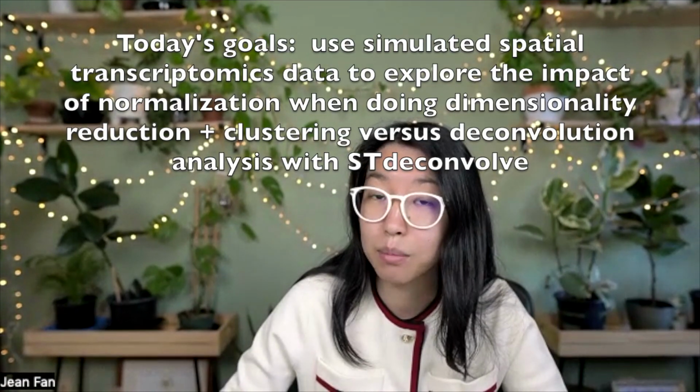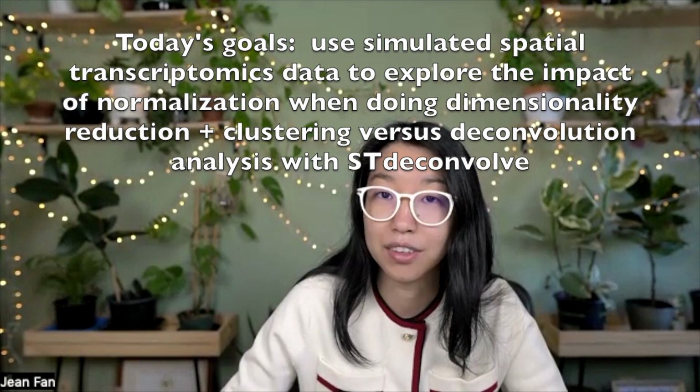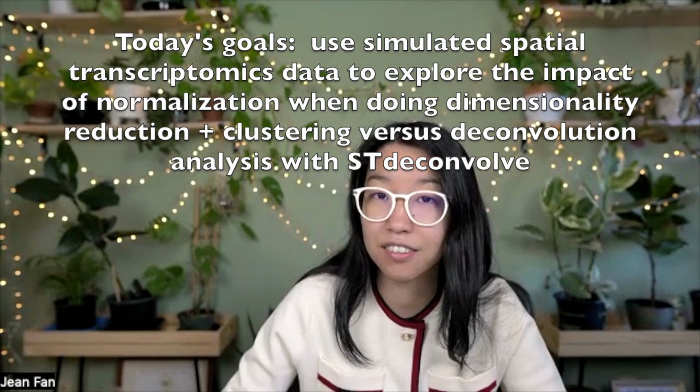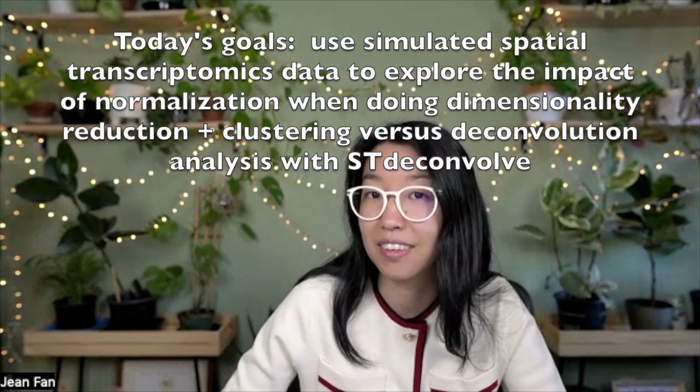I'll use a simulation to explore the effect of normalization when doing dimensionality reduction and clustering analysis, as well as when doing deconvolution analysis with STdeconvolve. Okay, so why don't I go ahead and share my screen?